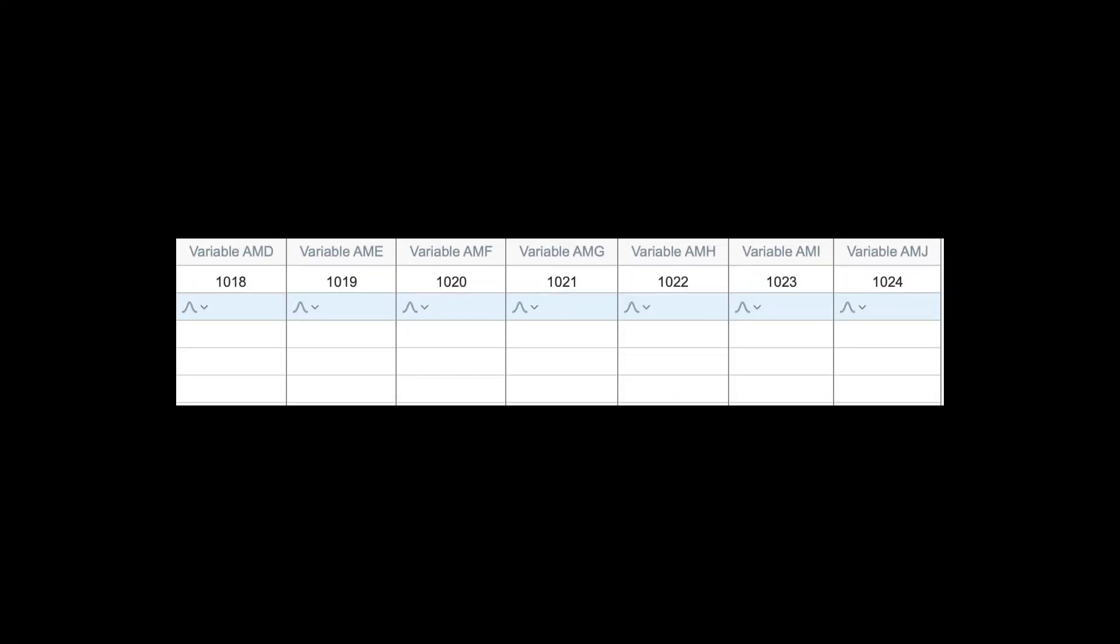In Prism 9, this data table, and all the others, have increased to 1,024 columns and 512 subcolumns.